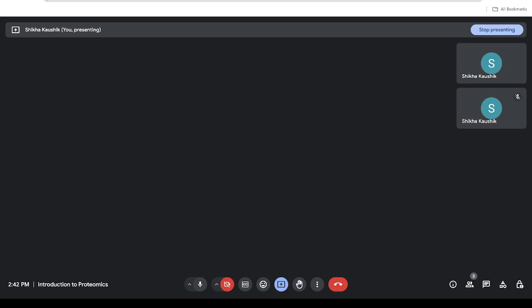Okay, you are saying A. Yes. Why? Because it's giving more Gaussian-type peaks, that means the coverage is high. Here you have distorted or scattered peaks and fewer peaks, that's why this is not showing a better protein coverage.